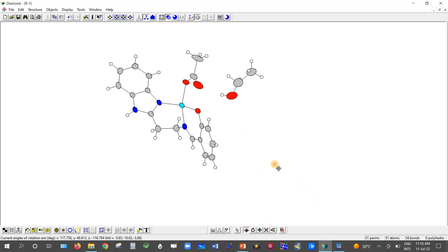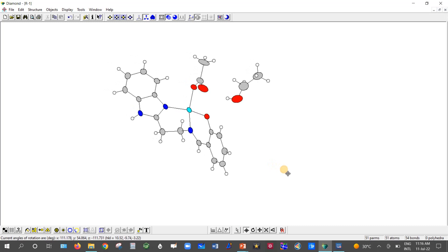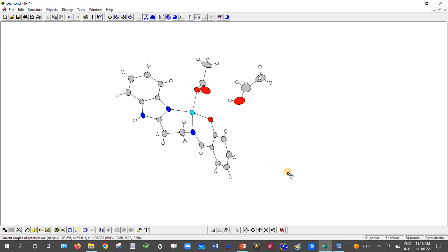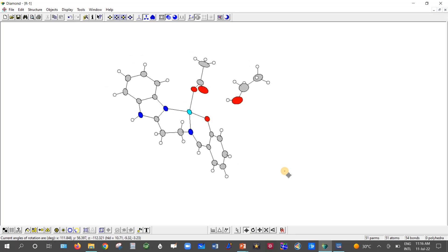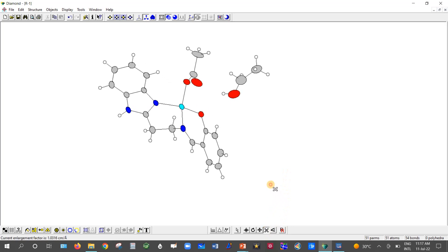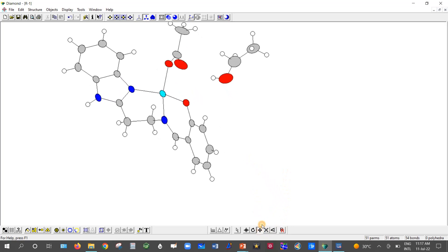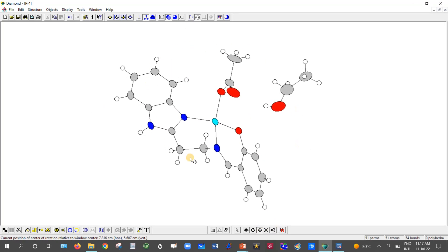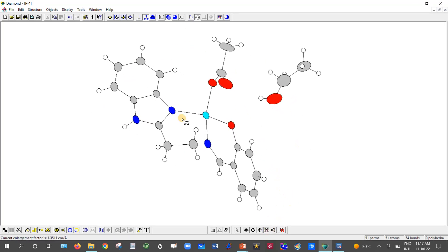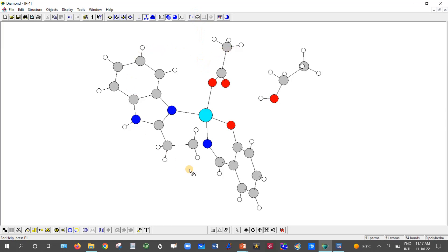Move the molecule to a direction where all the non-hydrogen bond atoms are at least visible. Enlarge it a little bit using the enlargement factor, and use the shift key to move it. Now the molecule is visible clearly — all non-hydrogen and hydrogen atoms are visible. There is an ellipsoid option which you must select; otherwise the atoms will appear as balls. It is necessary to select the ellipsoid option.